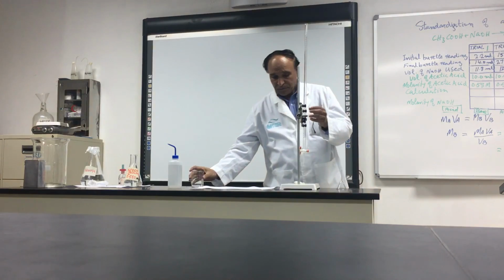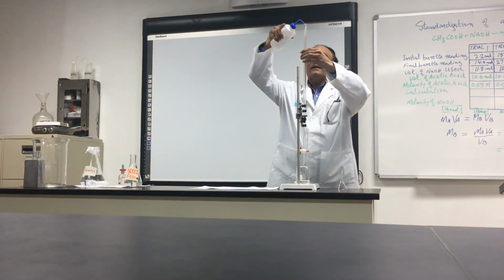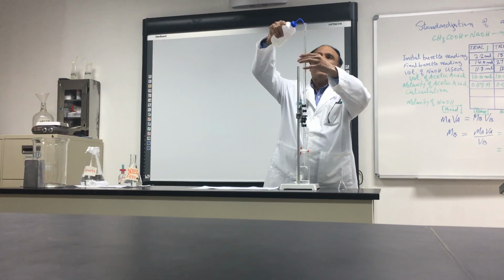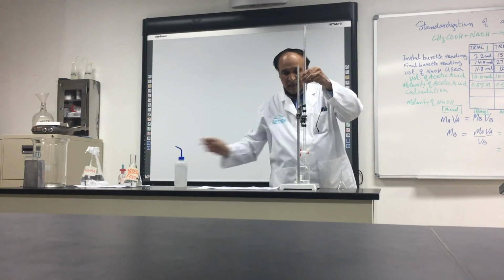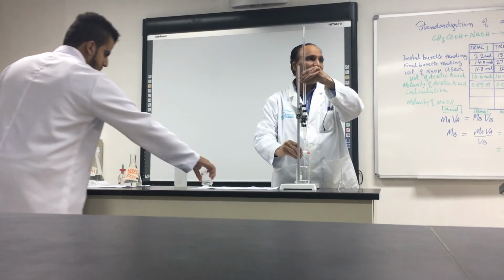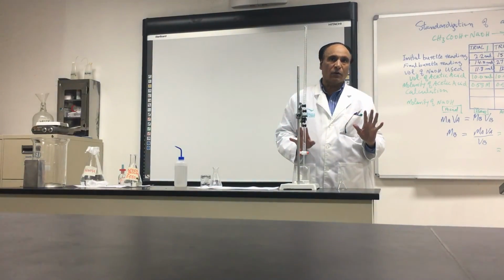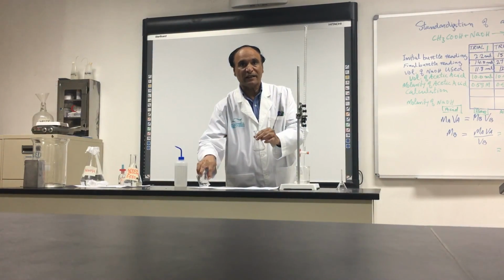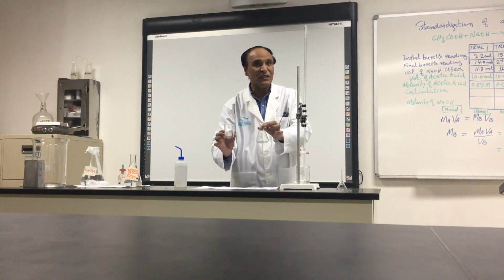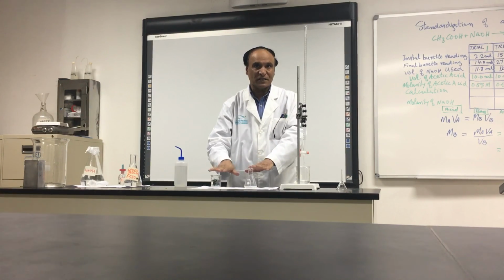So what you do, you put some distilled water in the burette. Look over here, in that way. Did you see that? Yes. Put some distilled water over here and leave it open. Don't close it. When you go home, leave it open. Leave it like that, and don't wash with distilled water, because your experiment is finished. The other student will come next time and they will wash it. You know this thing.